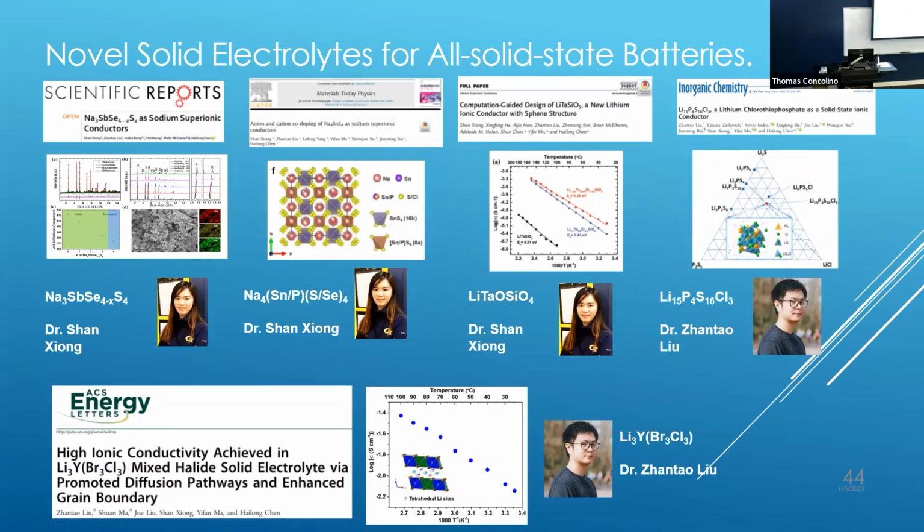But with the results run in our lab, we ramp up to one temperature, and then the scanning time is about 1 hour. We stabilize it for maybe half an hour, and then run the XRD for 1 hour. Of course, we cannot say there are absolutely no kinetic effects, but mostly I think it is close to equilibrium.